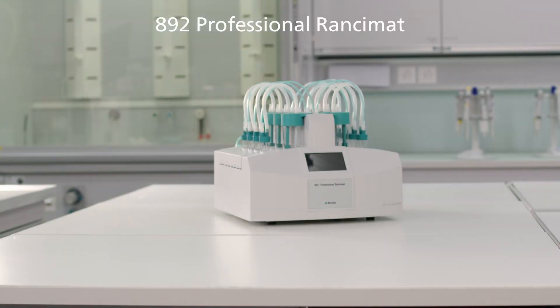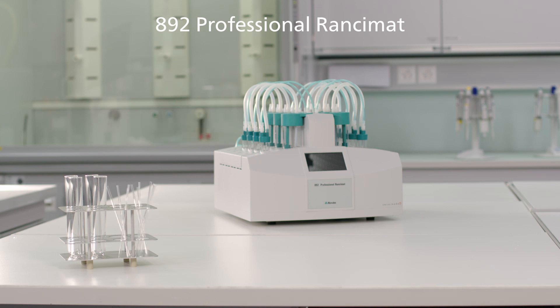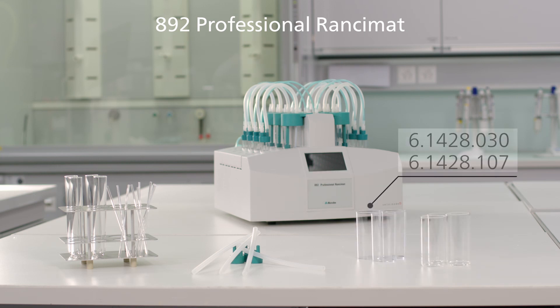Before we start I want to give you an overview of the different accessories for the three instruments. For the oxidation stability measurement of oils you use the short reaction vessel, the air tube for oil measurements, the silicon tubing and glass or polystyrene beakers.